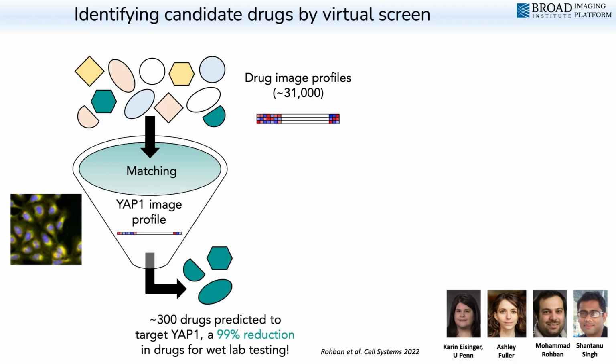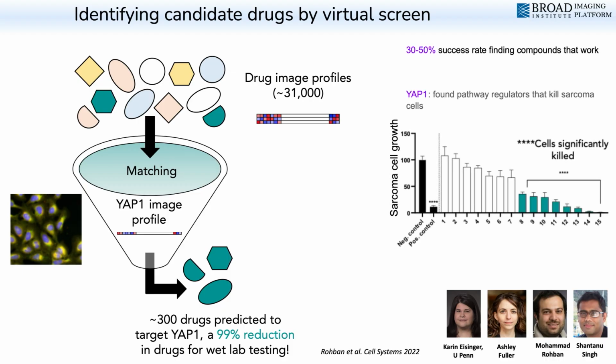And you say, you know what, I'm not going to screen the whole 5 million compounds. I'm just going to screen this top 1% of matches that I found here, and then go and do wet lab testing. We actually did this ourselves, despite being a small academic lab, for about 7 genes, and we found promising modulators for three out of the 7 of them, something like 30 to 50%, depending on how you count. One of them turned out to be very promising for sarcoma, and that led my co-lead Anne to start a company based on that, just pursuing that one lead, right?